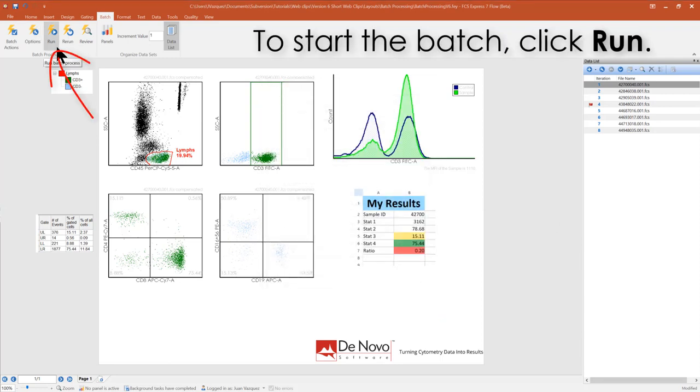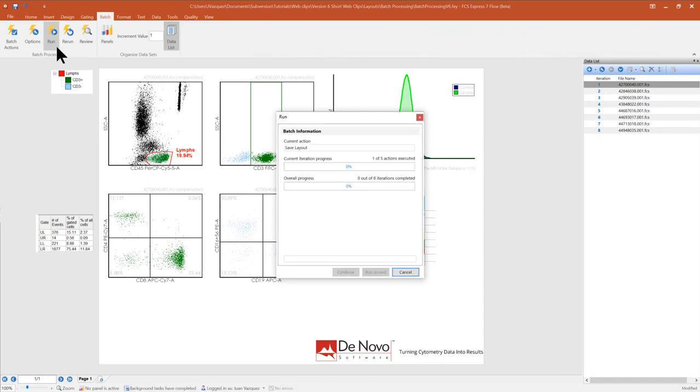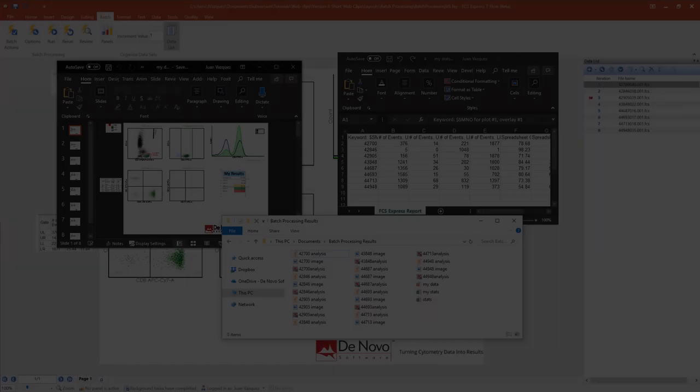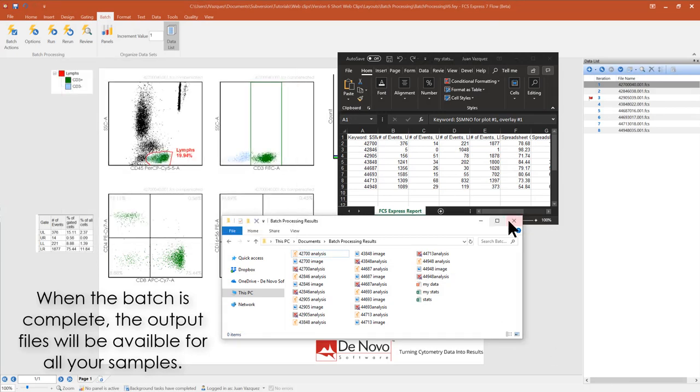Start the batch, click Run. When the batch is complete, the output files will be available for all of your samples.